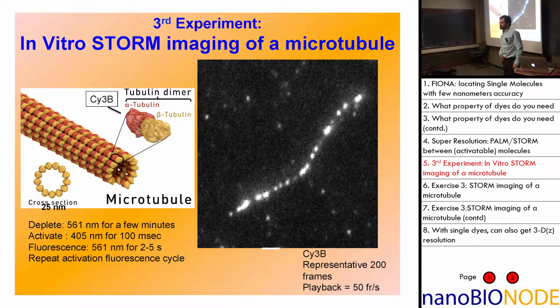Why is that? Because they're within lambda over 2. They're within lambda over 2, and we've accidentally excited both of them. And so when we go and we plot this, what will we see? Yeah, that's right. Normally, if it's one, this is about 250 nanometers, and this looks like a Gaussian.